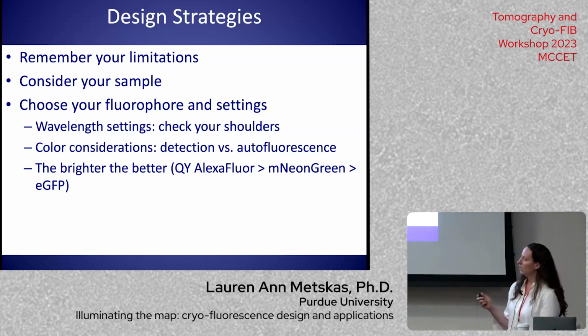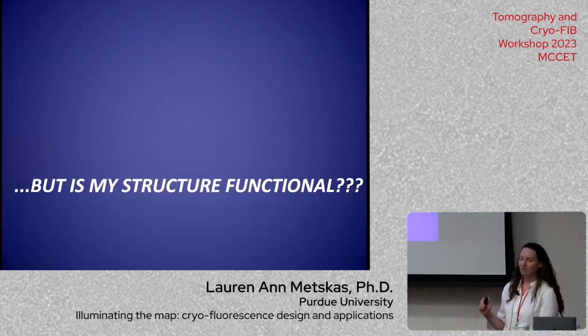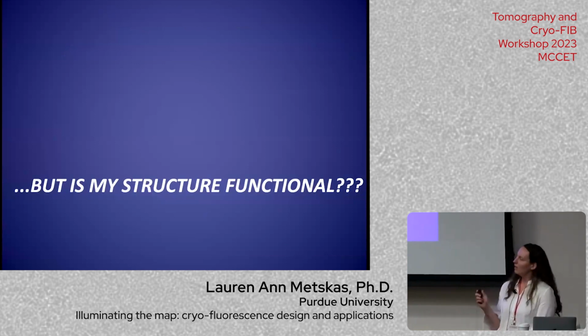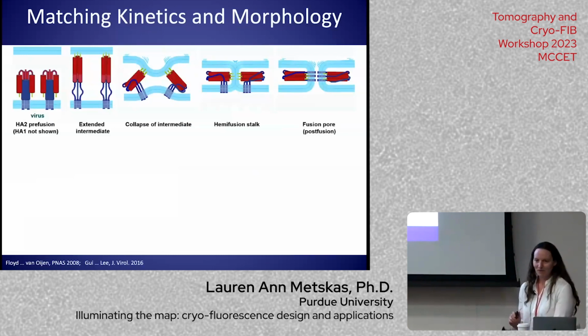All right. The final little bit of my talk, and the one that I find the most fun, is: is my structure functional? I've done all of this work. I've done my cryo-CLEM. I found my carboxysome or my virus or whatever I'm looking for. How do I know that this structure is actually the functional form? We put all of this work into it, but we don't know that going in. So we can design experiments for this.